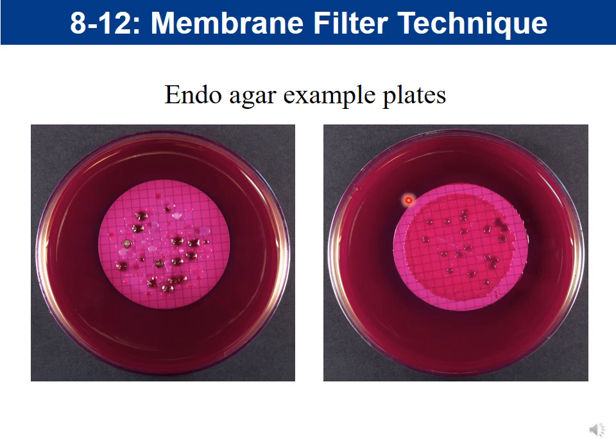See how this part out here is clear? There's no colonies out here. That's where the collection cup sits on top of the filter. See how you can see these colonies on that part? What that means is that because that part was normally in the magnetic part where the cup sits, those little colonies there are likely from the collection cup itself, meaning that it carried over from the previous water sample.